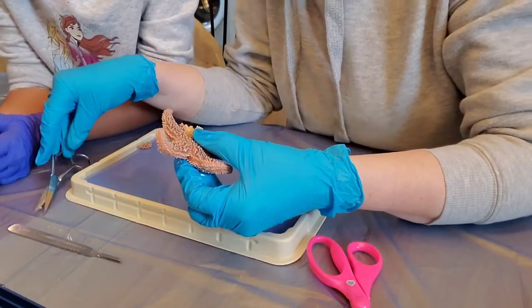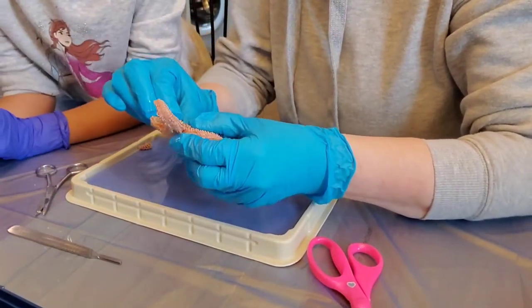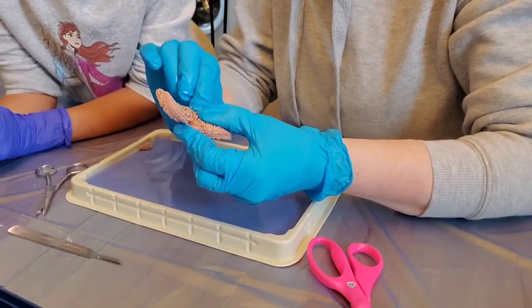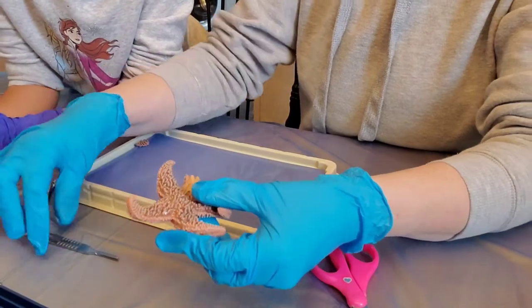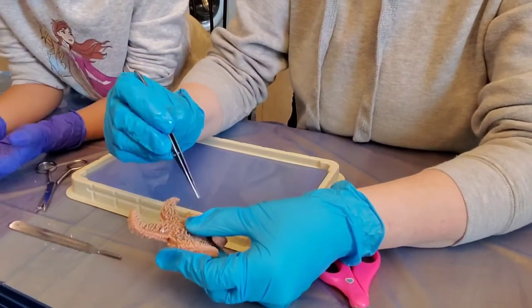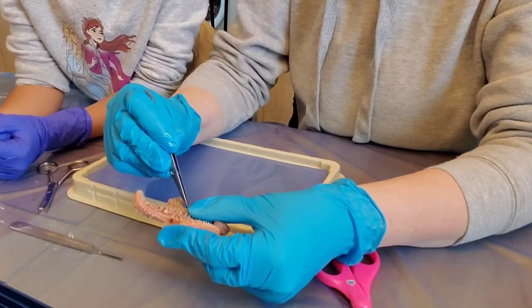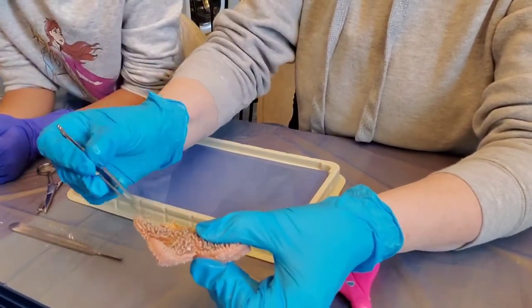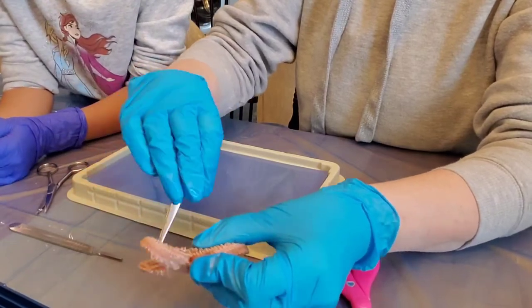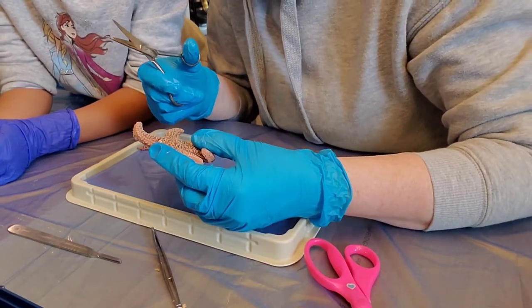This is where it exposes the internal organs — so I have to go down more. It is kind of gross! I'm trying to make it look like the picture.